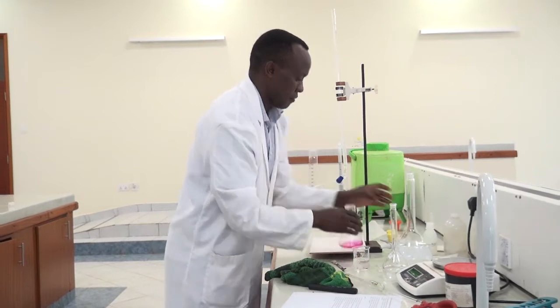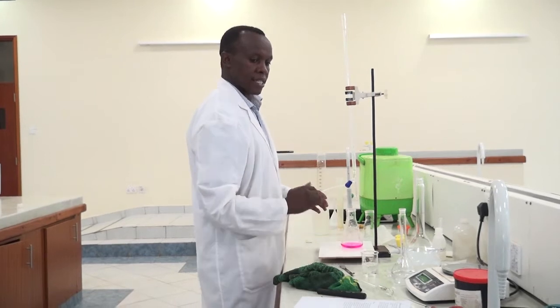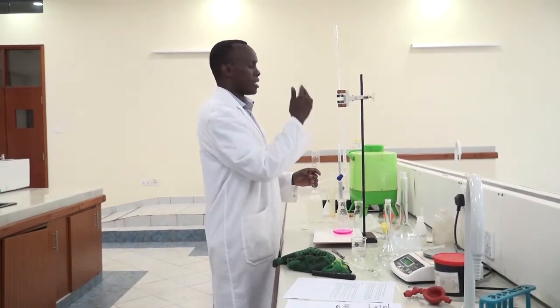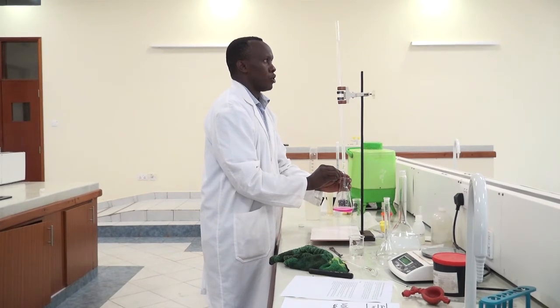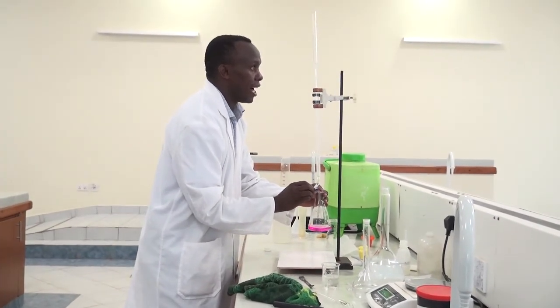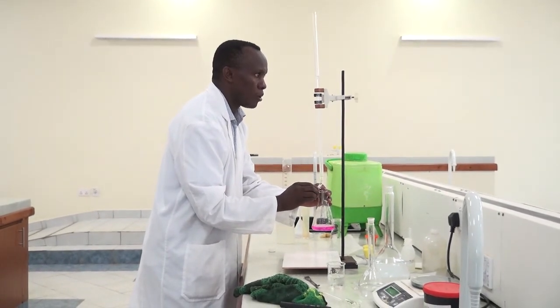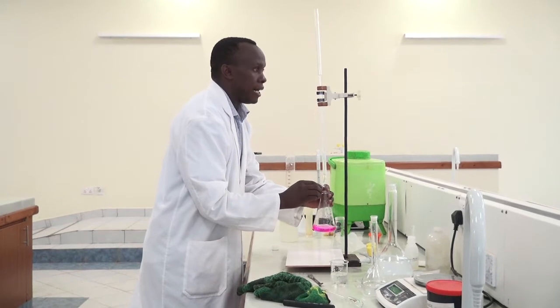Similar to the second titration, the way I've done it, I'll run around 18 mils continuously before I start adding drop by drop, because now I've determined where my endpoint is, so I won't waste a lot of time adding drop by drop. I just add continuously until I've added almost toward the endpoint. From there, I start adding drop by drop until I have my endpoint.